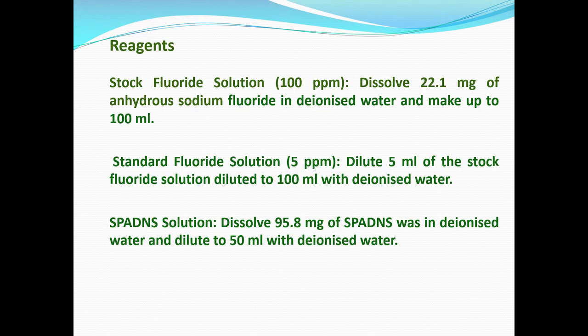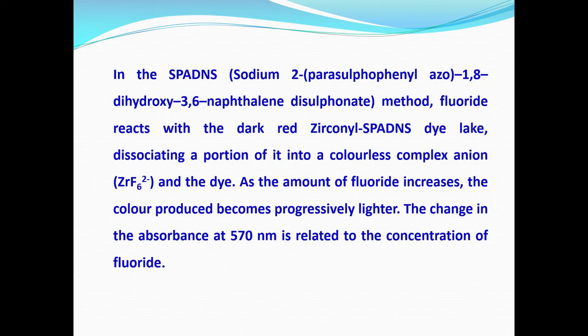So, the principle of this method is that this complex SPADNS reacts with zirconium to form a red dye.